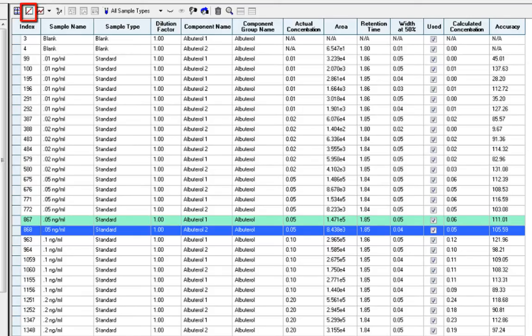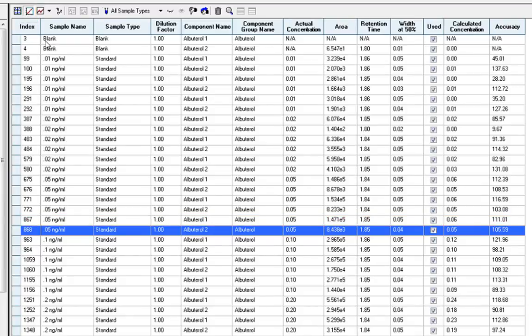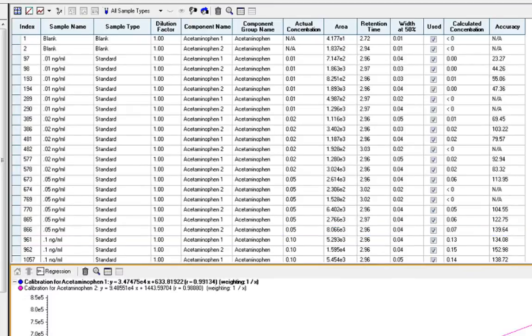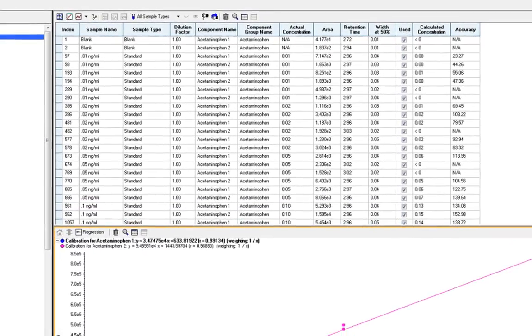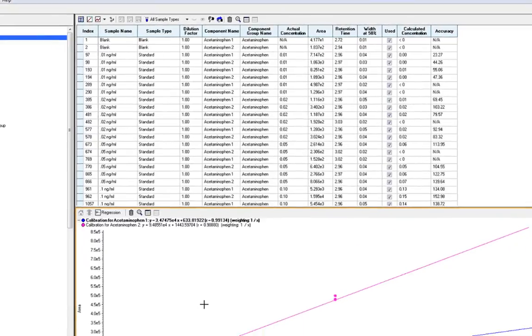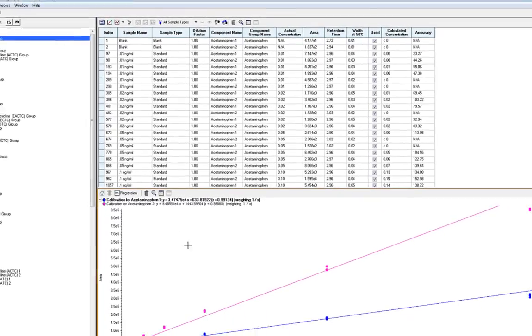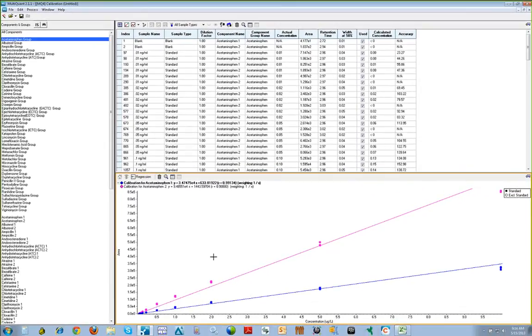We can also easily review all of the calibration curves for the dataset by clicking the second icon from the left side of the top navigation bar. The calibration curve in view is updated as different compounds are selected. Here, we have the acetaminophen group selected, so we are able to review the calibration curves for both the quantifier and the qualifier MRM transitions in this single window.